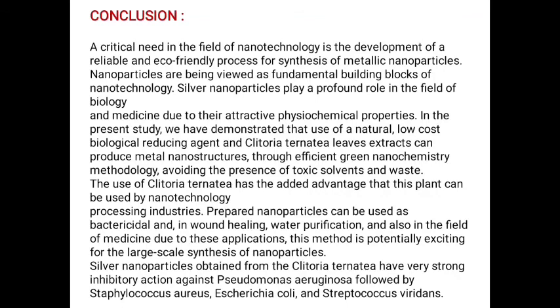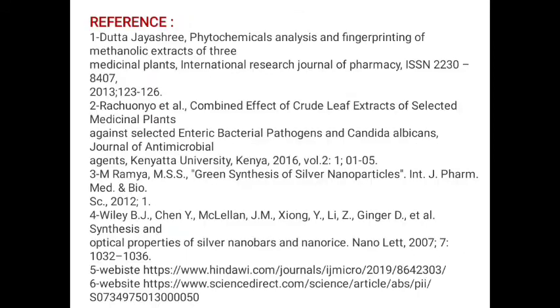This method is potentially exciting for the large-scale synthesis of nanoparticles. Nanoparticles obtained from the Clitoria ternatea have very strong inhibitory action against Pseudomonas aeruginosa, followed by Staphylococcus aureus, Escherichia coli, and Streptococcus viridans.